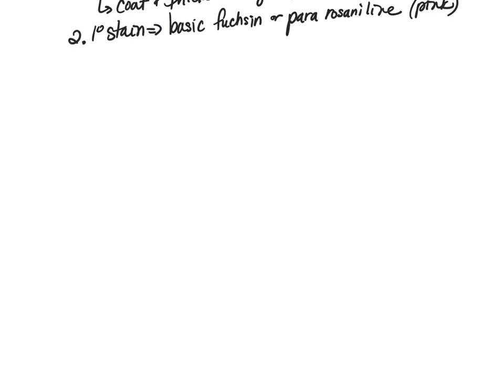All right, so all of those different types of stains that we just went through are used for light microscopy. So something that we would use in our bright field microscope that you would typically see in a laboratory in a classroom, oftentimes used even in pathology as a light microscope or bright field microscope. But when we talk about other different types of microscopes that we have talked about, we do have to take into consideration the different ways that we have to prepare specimens for those microscopes.